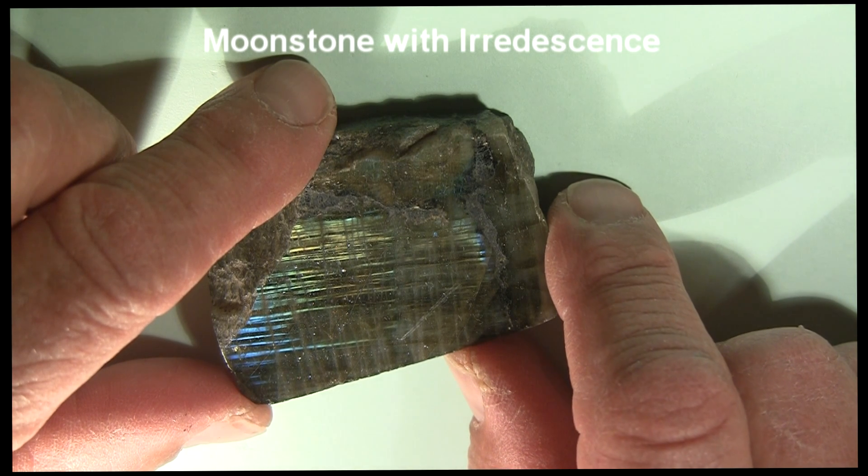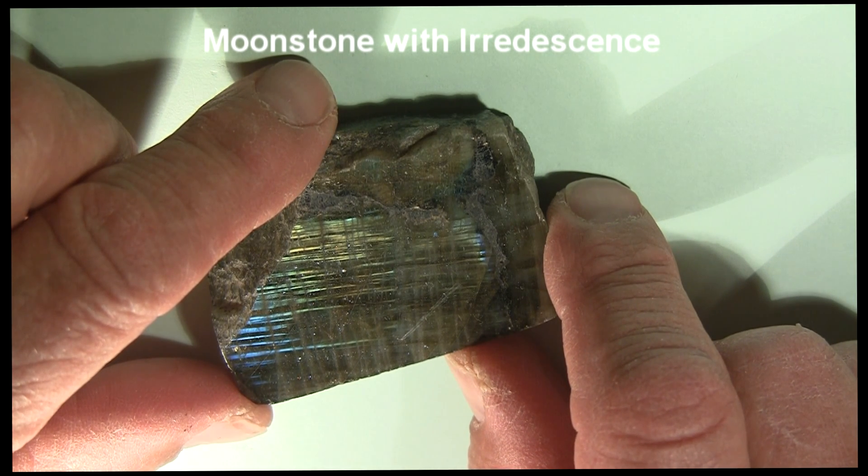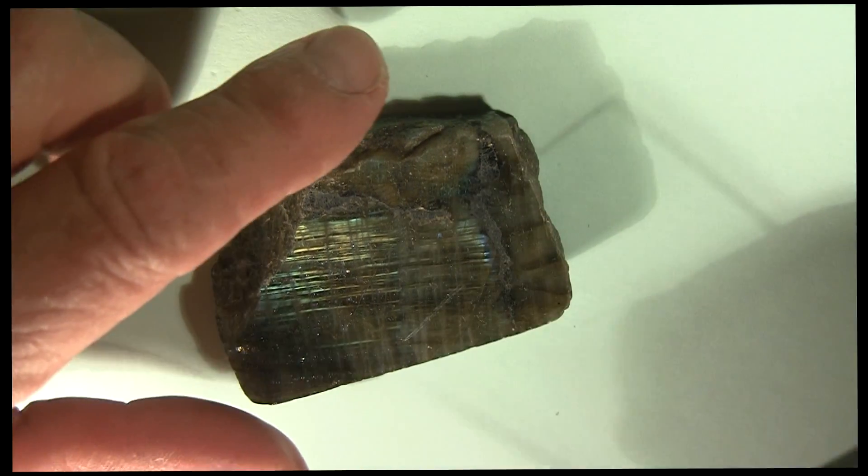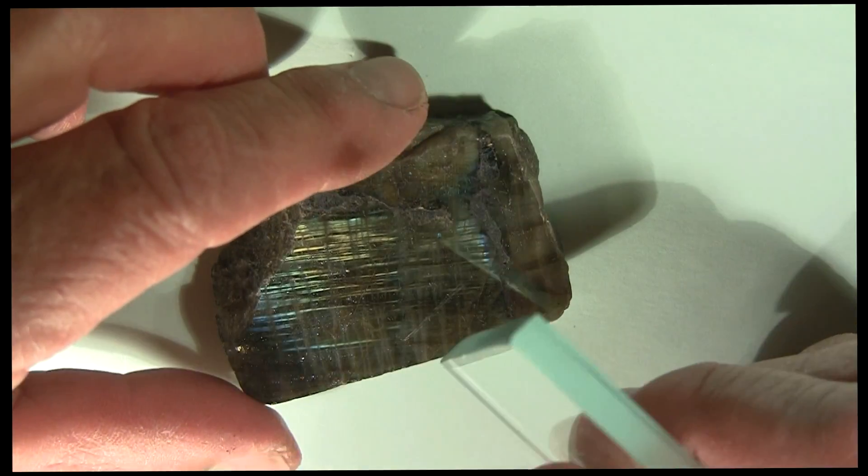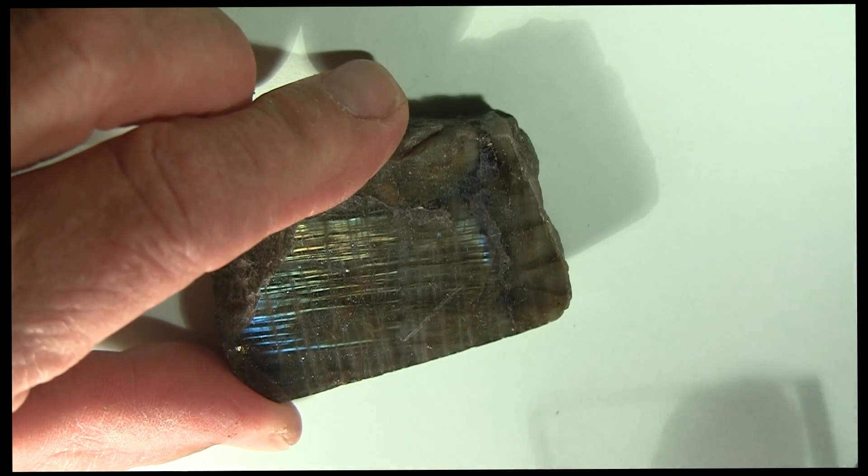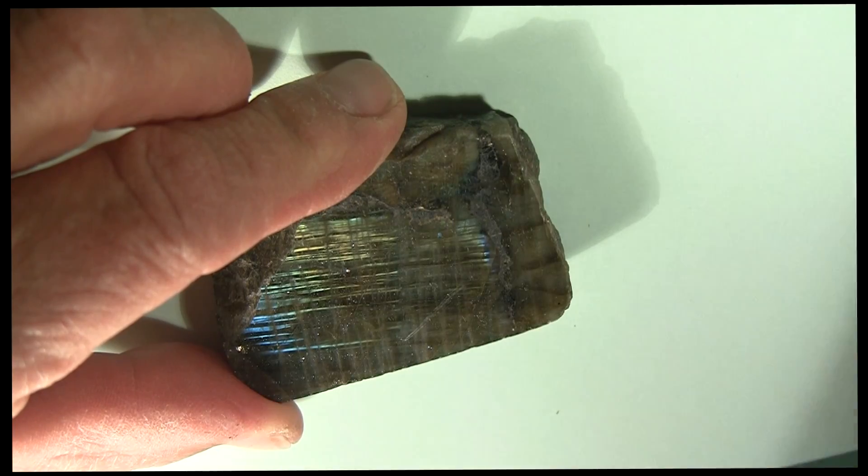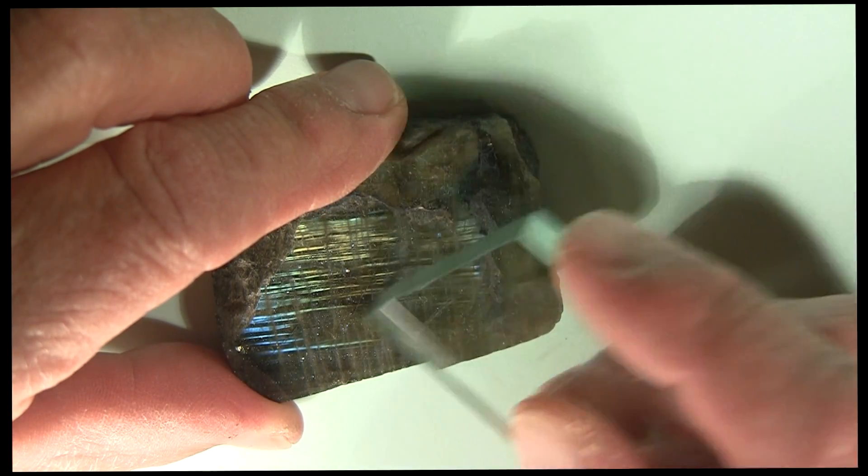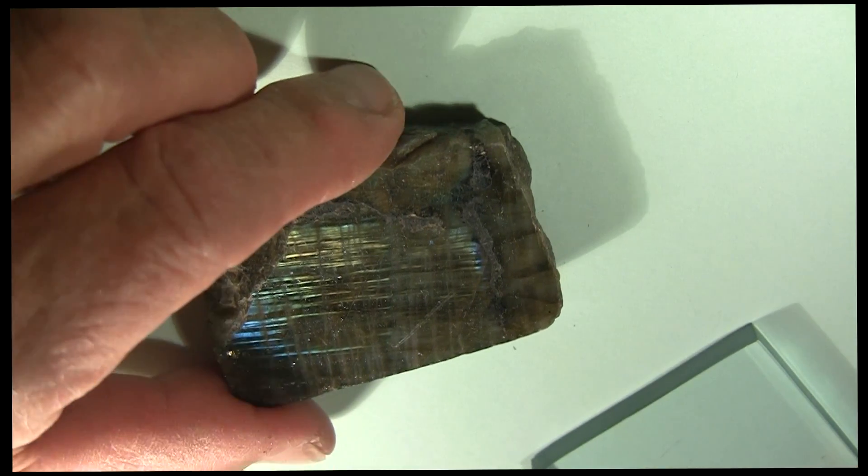Now the hardness of plagioclase feldspar is 6. That means it is harder than a piece of glass. So I'll rub this piece of glass across the surface here, of this polished surface. See if I can't scratch it. A little bit of the glass comes off, but it definitely did not scratch the plagioclase, the labradorite.